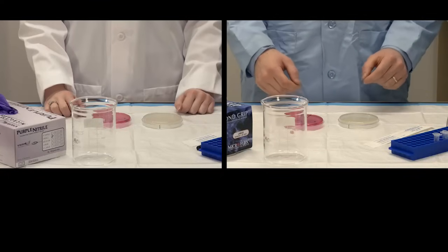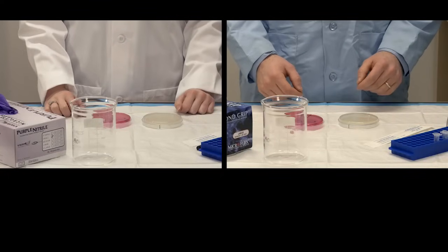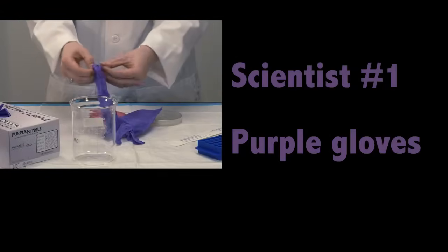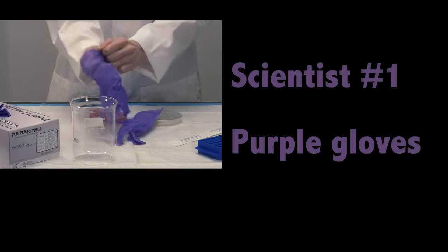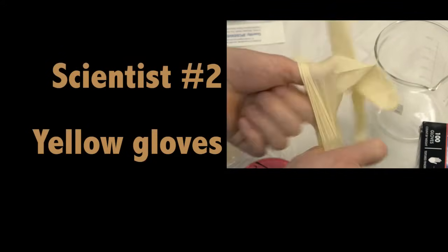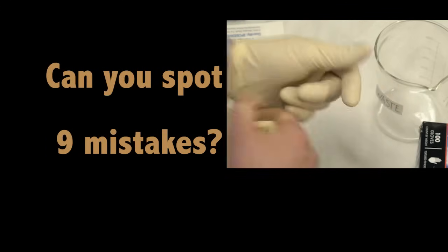Here, we have two scientists demonstrating the Kirby Bauer antibiotic sensitivity assay. Scientist number one, who's wearing purple gloves, will perform the assay flawlessly. Scientist number two, who's wearing yellow gloves, will make nine mistakes. Let's see if you can spot them.